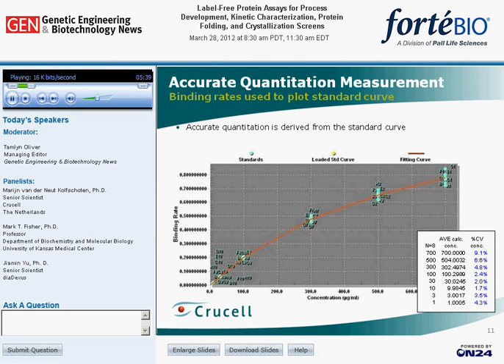A typical standard curve is shown in this slide, which is used to measure accurately IgG concentrations in unknown samples. Interestingly, the range of such a calibration curve is rather broad, and moreover, the same curve can be used again in the next assay, provided that the dilution buffers used are the same. Next slide.